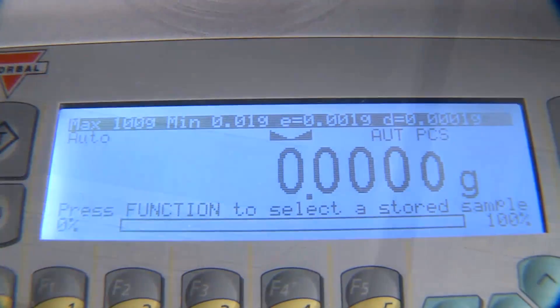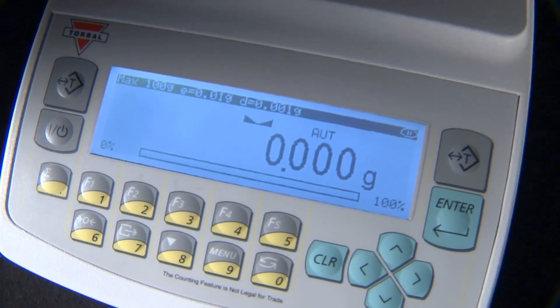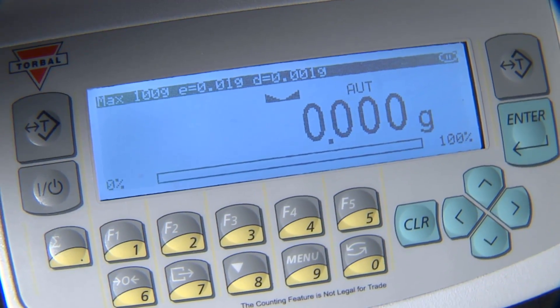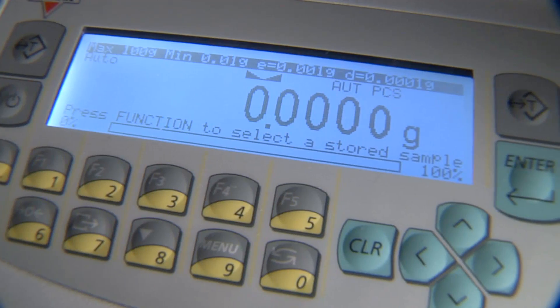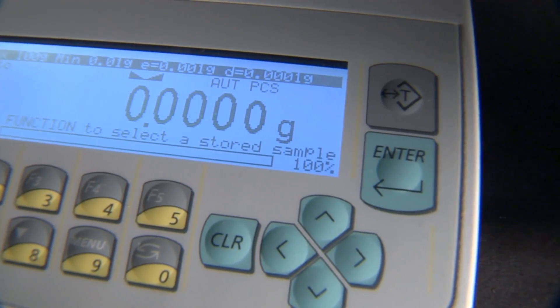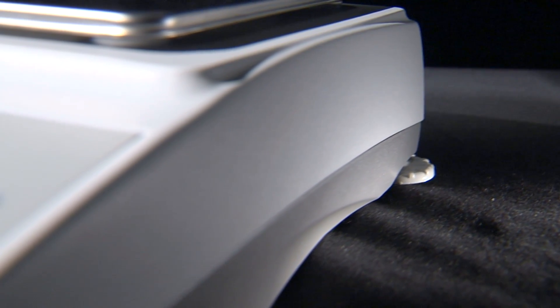The AG series features a large backlit graphical LCD that displays on-screen instructions designed to guide users quickly through the scale's functions. Every unit is equipped with a 20-key sealed numeric keypad that includes dual tare keys as well as navigation keys that make the menu interface very easy to use.